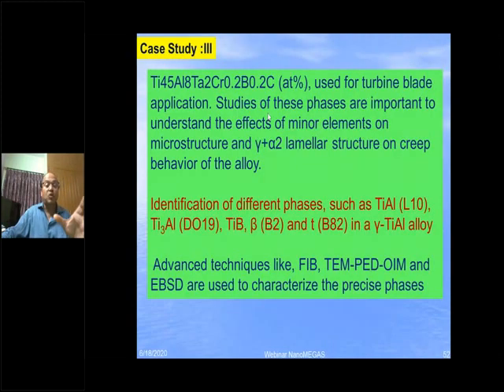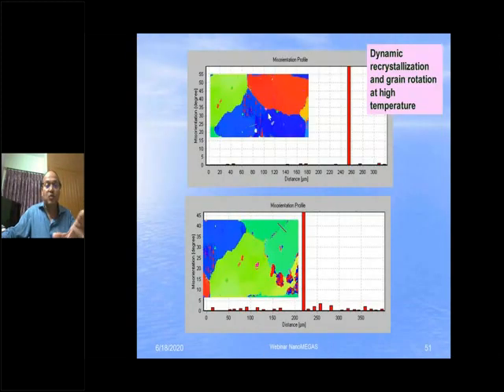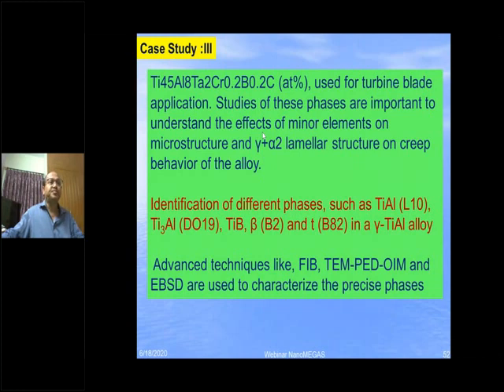So this particular case study has told us that there is a very fine recrystallization taking place inside the grain, which is not possible to see in other techniques. I will go to the third one. That is that titanium alloy.